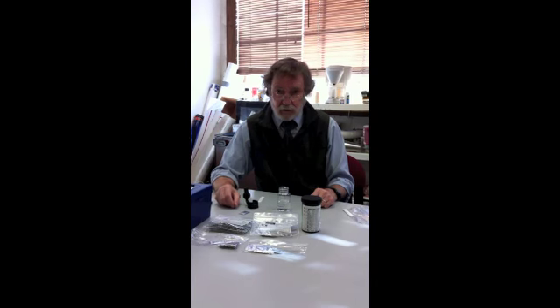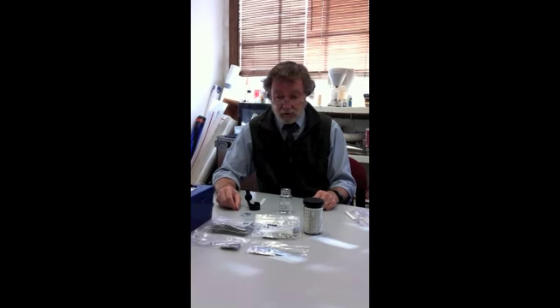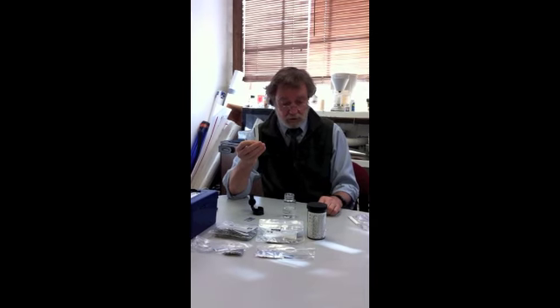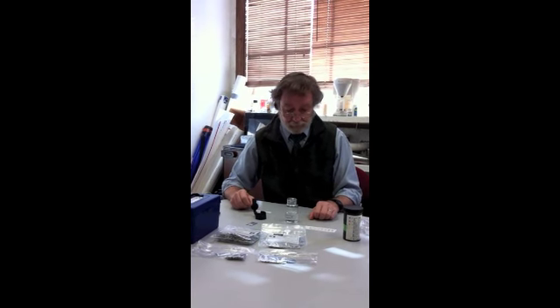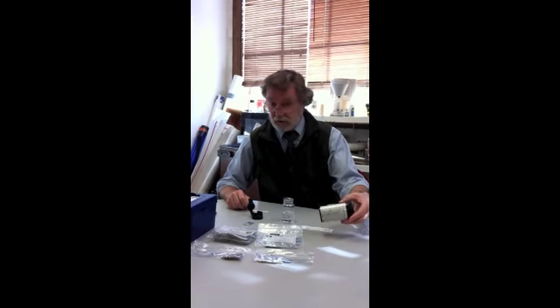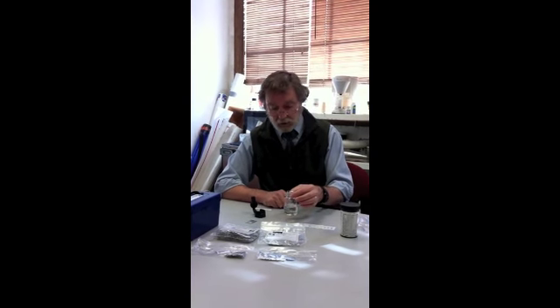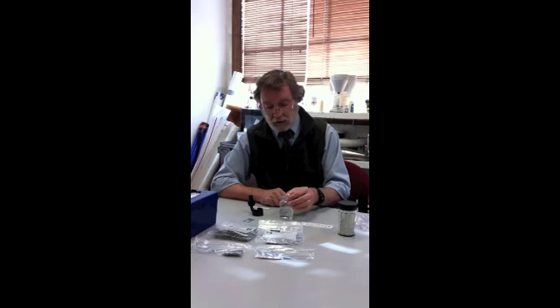So in the test kit that you received in the package, there are a number of components that you will need to make the measurement. There are two reagents, and they're in separate packages here, and there are a number of test strips that look like this. And we've also made for you a copy of the standard colors that are printed on the side of the vessel that you would get if you bought the test, all of which comes in this little handy package here.